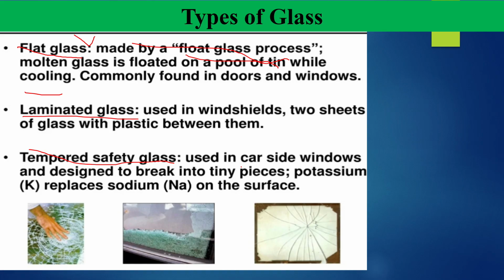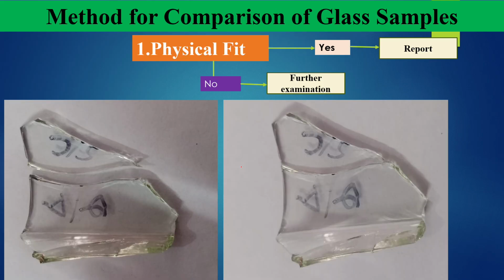Now we will talk about the methods used for comparison of glass samples. The first method is physical fit.